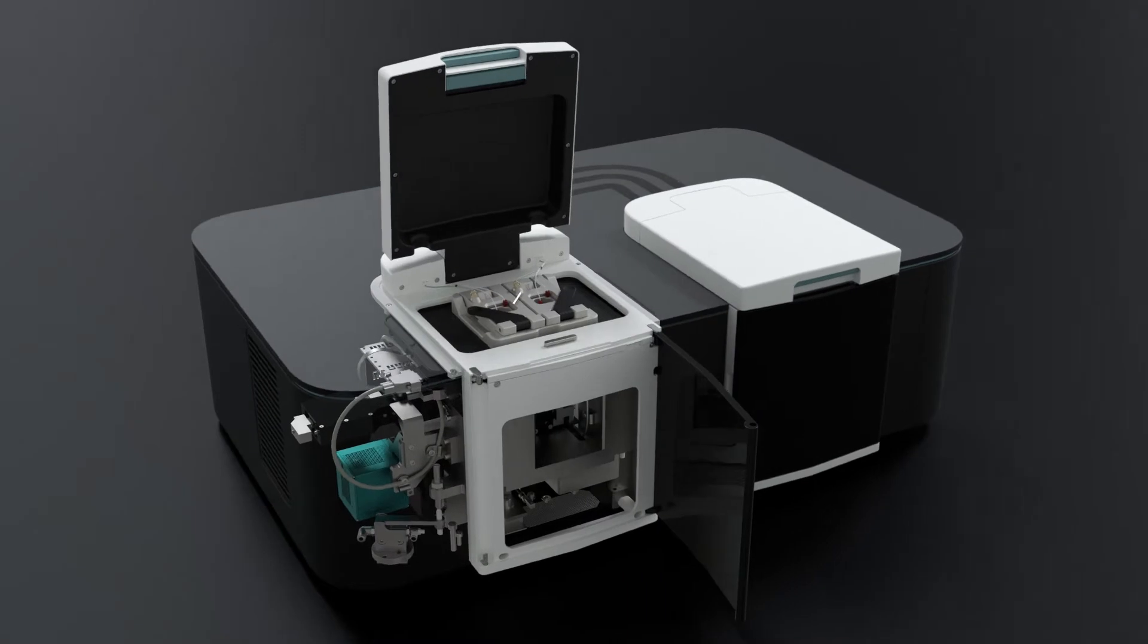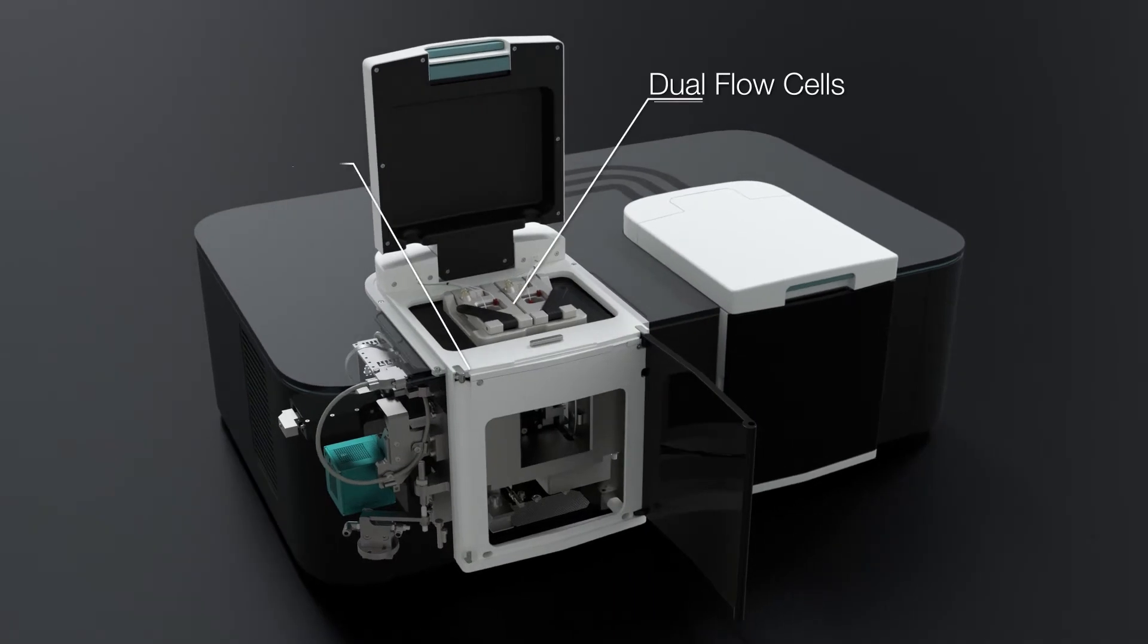The system allows for running two samples simultaneously and has built-in vibration control for enabling benchtop operation in a standard lab.